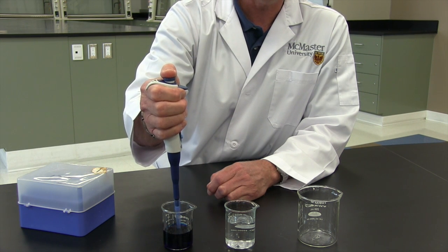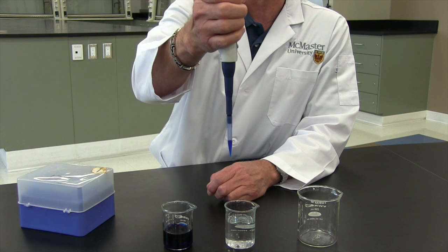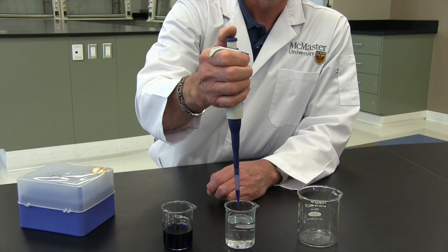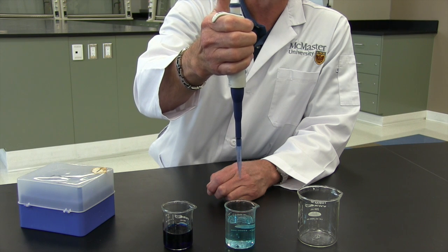I'm going to press down to the first position, and that represents 400 microliters. I'm going to go into the beaker with the blue liquid. I'm going to slowly release the plunger so that the vacuum inside draws up that liquid. I'm going to go to the second beaker where I want to place it. I'm going to press down to the second position. I'm going to draw it out and then release it.